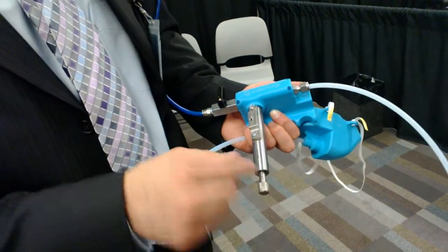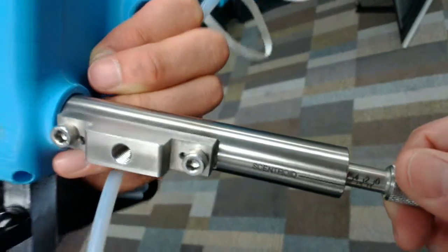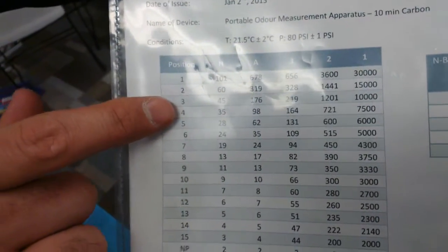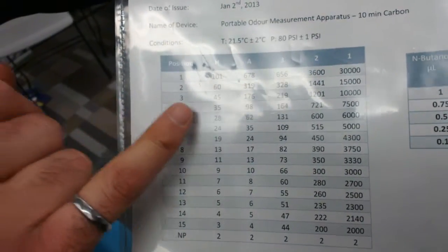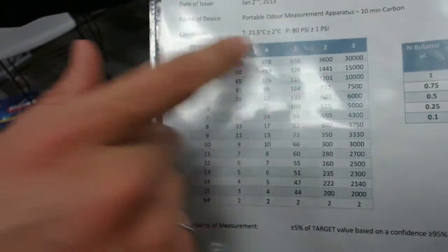We have numbers on the knob, and there's a chart that shows the different ranges. Let's say it's on this range — the number four corresponds to 35 odor units. This is how you can tell: the chart maps those numbers to different odor units.